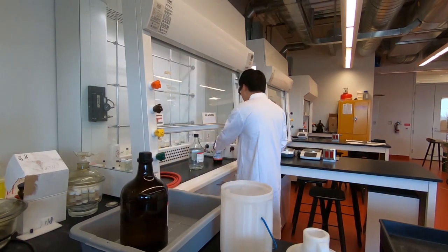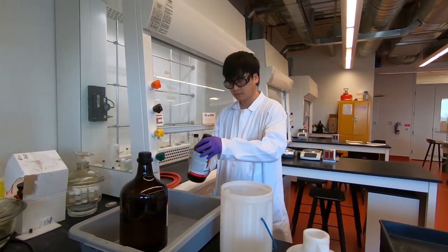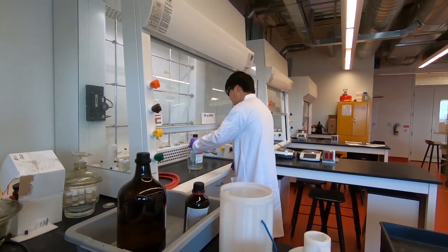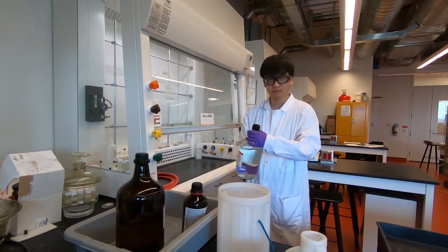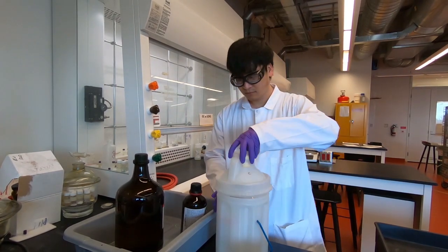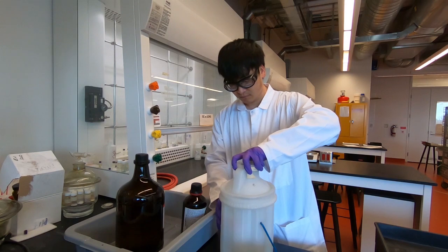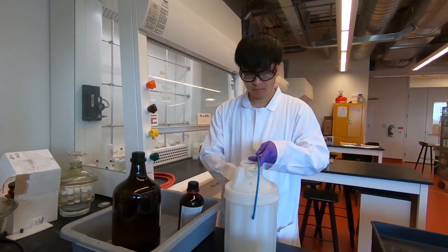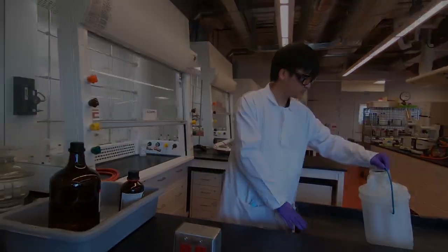Please make sure you carefully remove the bottles from your workplace and place them into the secondary means of containment. Here, we are demonstrating the transport of flammable materials in a tray, as well as an acid contained in a bottle carrier. All the secondary containers are then placed in a lipped cart for transport out of the lab.